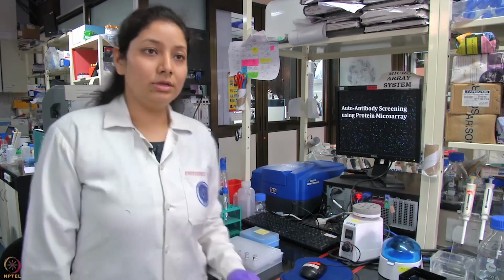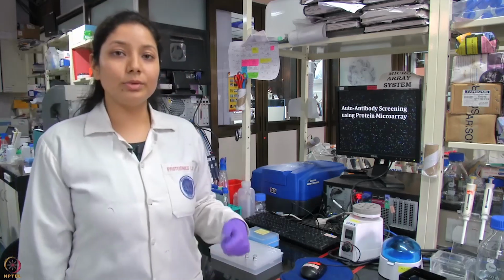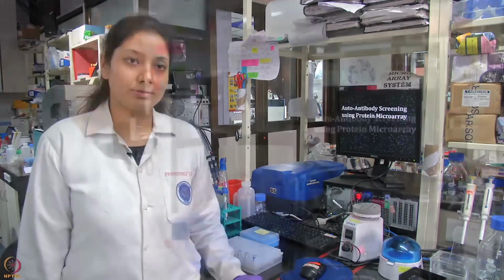Hello all, today we will be talking about one of the applications of protein microarray in cancer research, which is to detect the presence of autoantibodies in cancer patients. I am Nikita Gehoy and I am currently a senior PhD student working on detection of autoantibodies in cancer patients. So, let's start with the basics of protein microarrays.